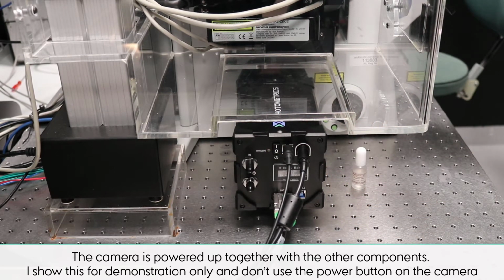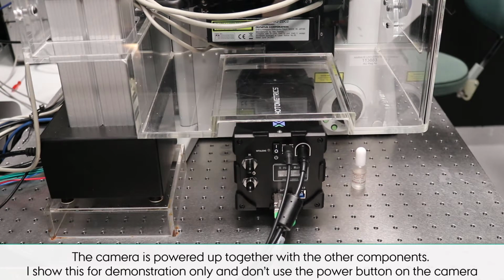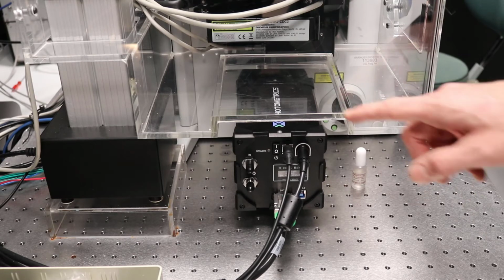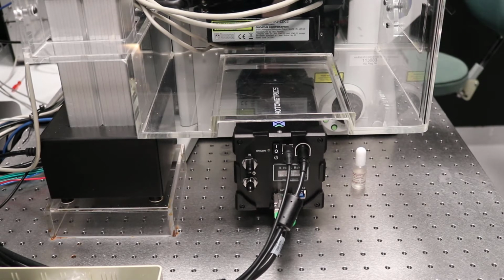After powering on, you can see that the camera is initializing, so you can see it's blinking. It does so for approximately 30 seconds, and after that it can be controlled by the computer. By the way, the camera is one of the most sensitive cameras on the market, so it has a quantum efficiency of 95%, so you really get most out of your photons.